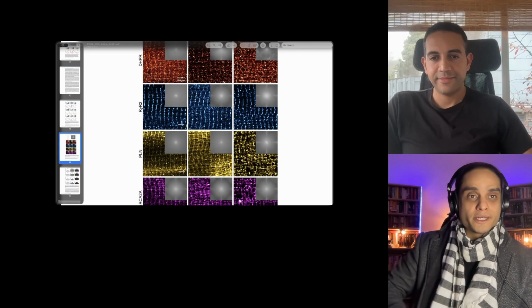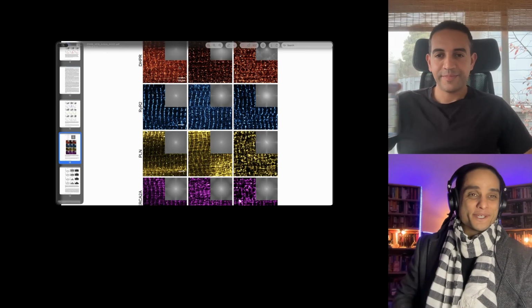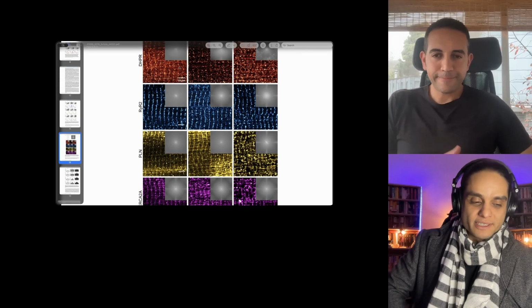Yeah. Same thing for the antibodies. Just use fresh antibodies. It's like, well, my staining doesn't work. Maybe you use an antibody that doesn't work anymore. So that's part of it.